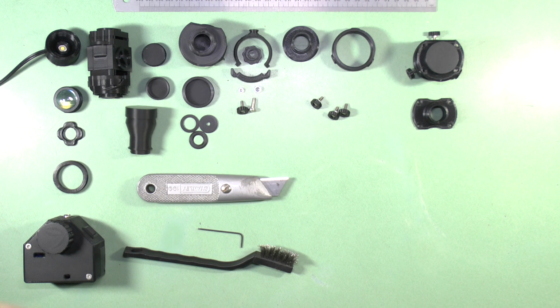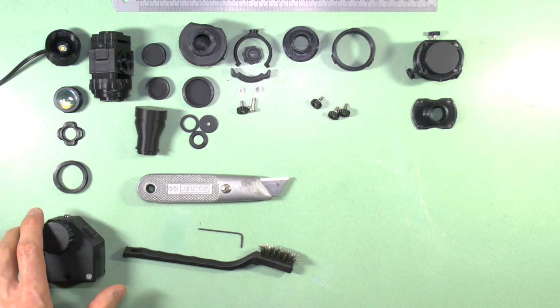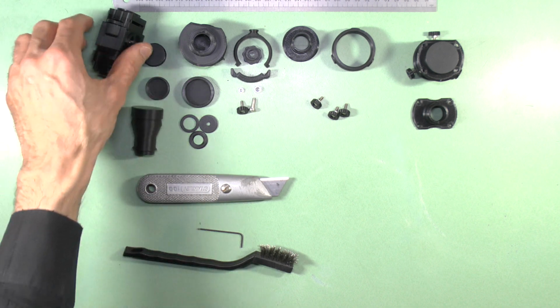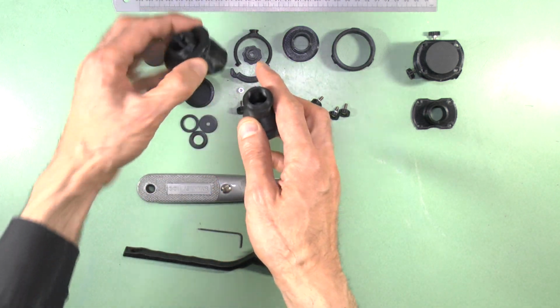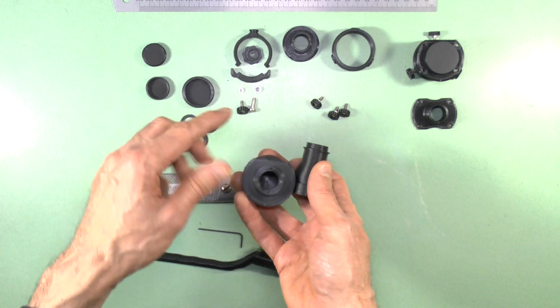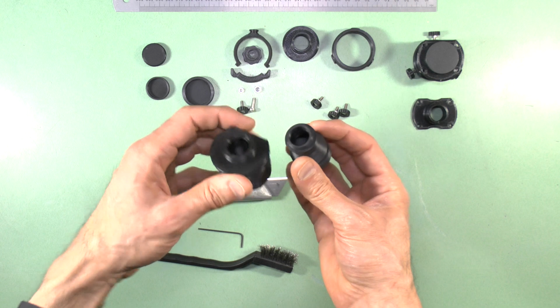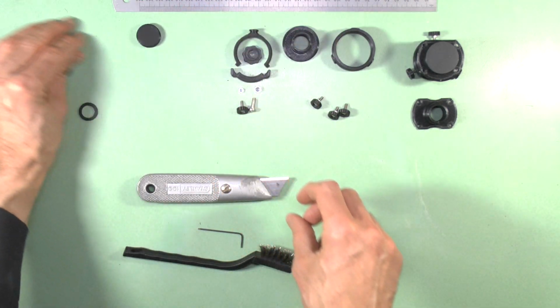The advanced filter block, LED illuminator and lower collector were described in separate videos, so that instruction will not be repeated here. The Epi-black body and Epi-condenser light sinks, the Epi-condenser apertures and protective caps just need printing plus the optional application of an internal matte black coating, so no further instruction details are necessary for these parts.